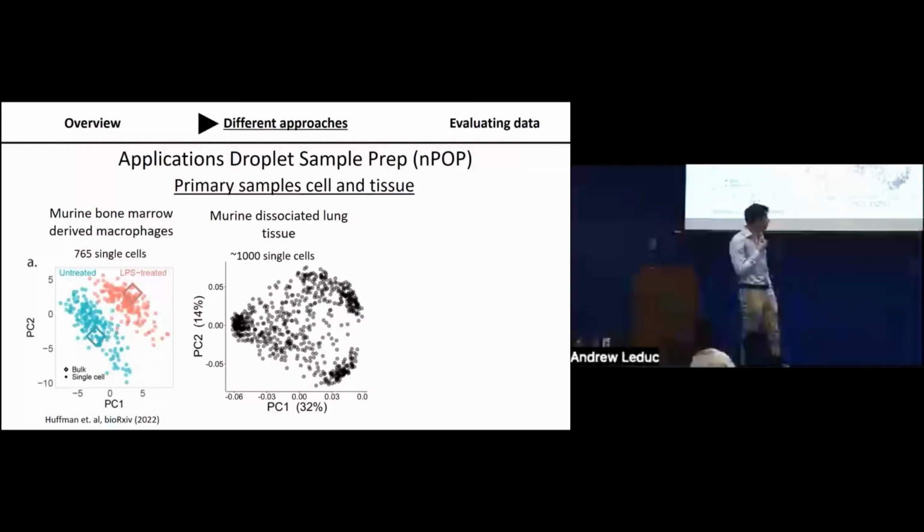So I can really only speak with any certainty to our sample prep. At least for our plate-based method, we dispense the cells into 1 microliter of water. We're then lysing them in this 1 microliter. We add about a quarter of a microliter of reagents for the digestion, and then another half a microliter for the labeling. So the final volumes end up being somewhere around 2 microliters.